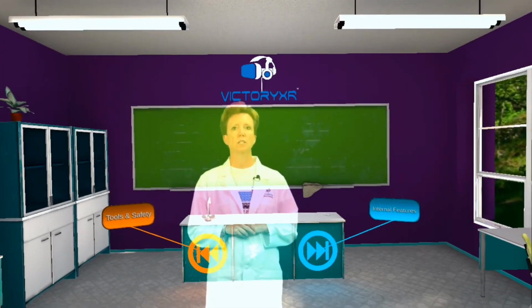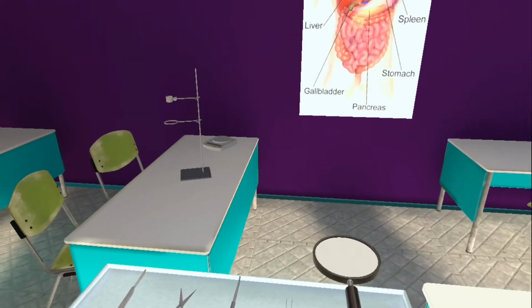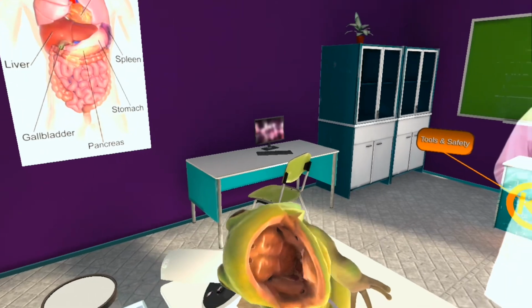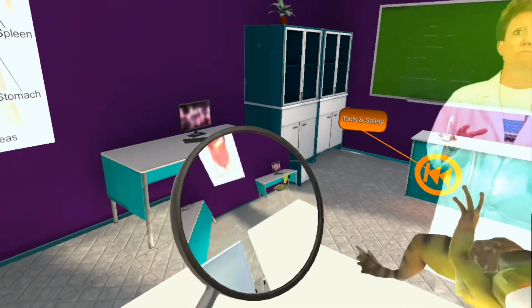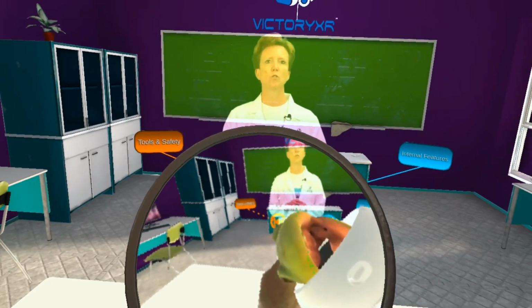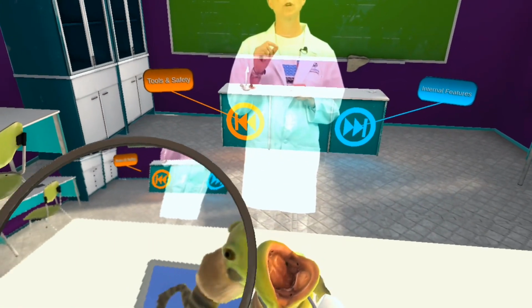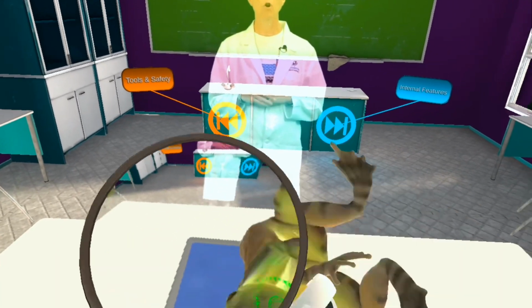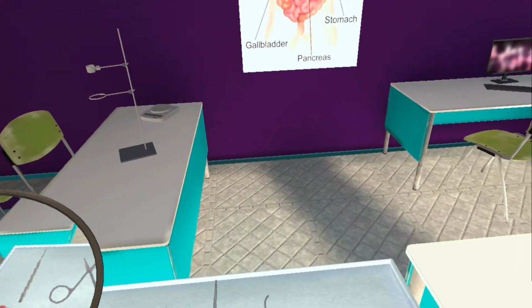Now let's go ahead and look at the inside of the mouth. Open the mouth with the forceps. Using the magnifying lens, look closely at the upper jaw. You will see many small maxillary teeth. The lower jaw has none. Near the internal nares are the two vomerine teeth on the roof of the mouth. Frogs don't chew their food. They swallow it whole. Therefore, the teeth they have are used only for grasping and holding the prey as they swallow.